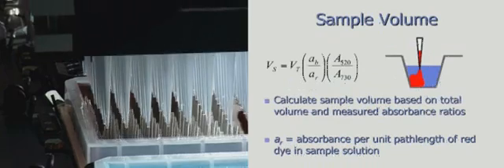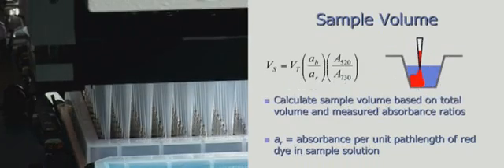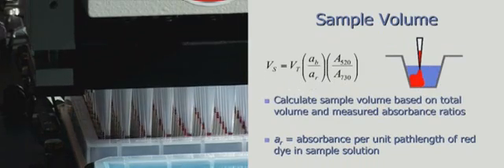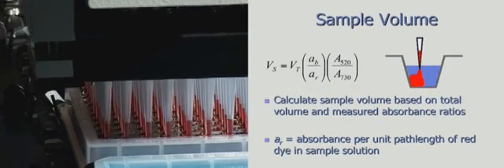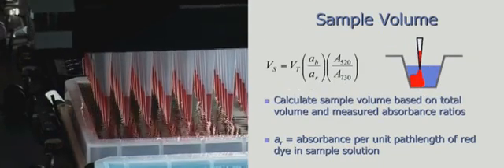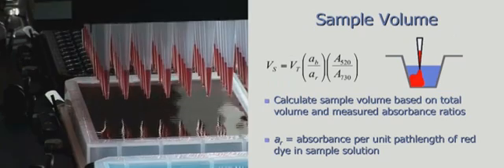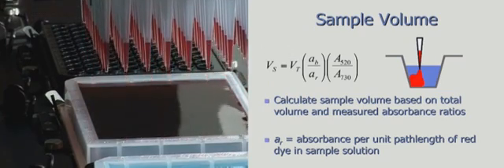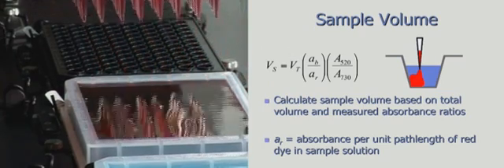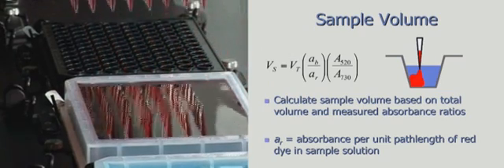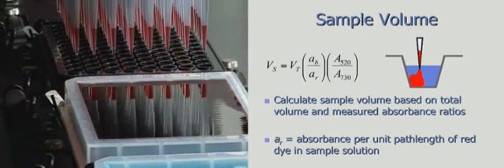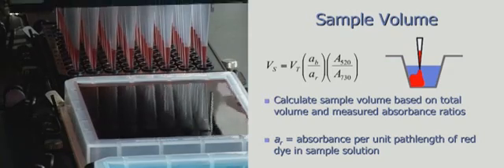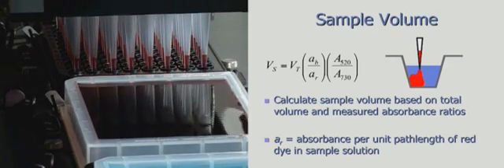Dispense the desired volume of sample solution into each well containing the diluent. The sample solution can be added before or after the MVS diluent solution, allowing simulation of your assay's dispense methodology. Cover the plate and place it securely on the plate shaker. The system controls the plate shaker speed and duration.